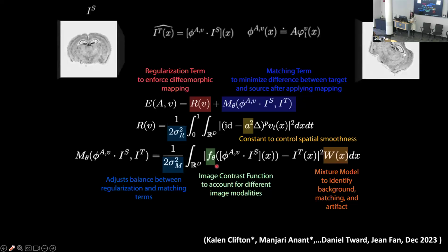Yes, question. Just a really basic question. So you're only working with the anatomical image at this point, not gene expression. Excellent question. Yes, we are only dealing with the cell density at this stage. And there's a reason for that I will get into. The reason actually is because we typically want to make comparisons in the gene expression space. So if we incorporate that gene expression in the alignment itself, it is a bit of a double dipping problem.